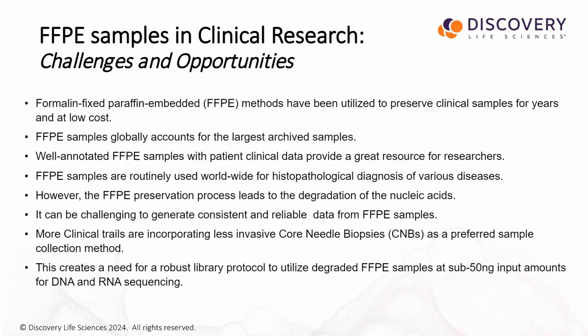One of the drawbacks of FFPE preservation that has been well discussed in publications and among the scientific community is that the FFPE preservation process leads to degradation of the nucleic acid. It's the cross-linking and decross-linking processes that are attributed to that degradation, thus making it challenging to generate consistent and reliable data from these FFPE samples.